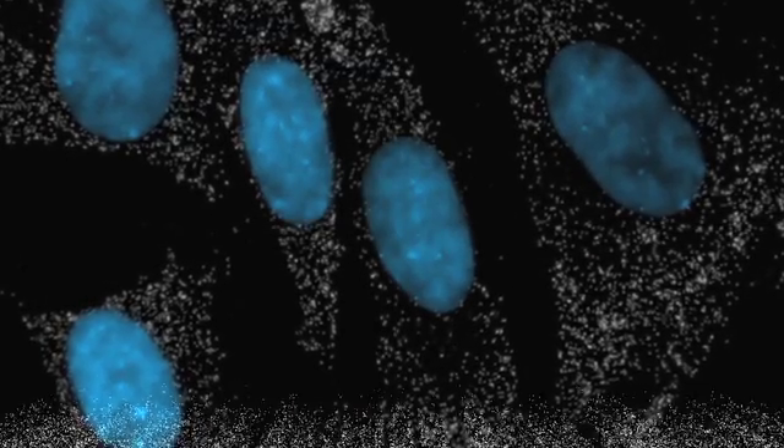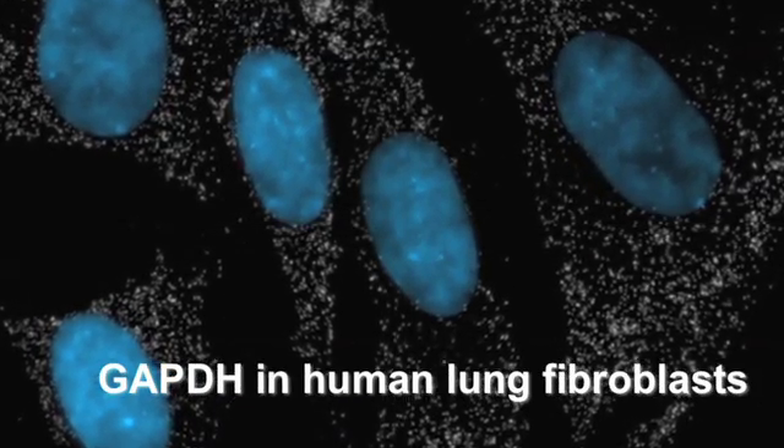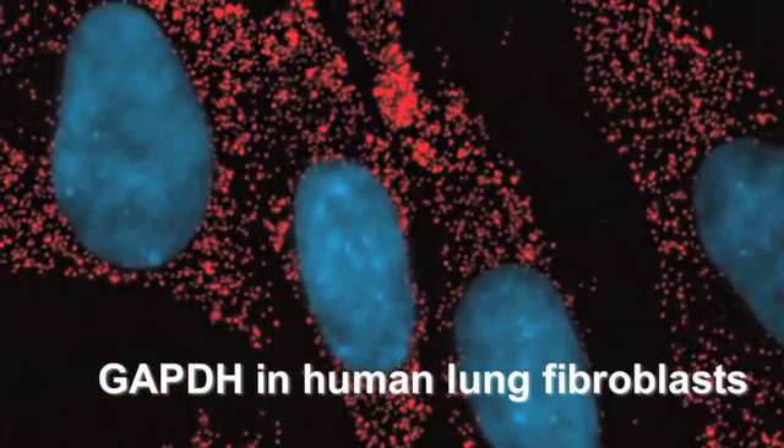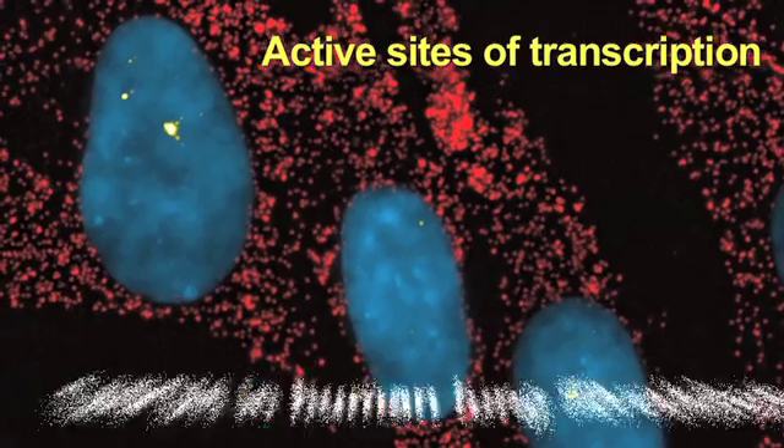One of the primary benefits of Stellaris technology is being able to visualize both the messenger RNA in the cytoplasm, as well as the active sites of transcription in the nucleus. And, unlike other commercially available RNA hybridization technologies, Stellaris FISH does not rely on artificially amplified signal. Stellaris probes directly quantify messenger RNA, providing more confidence in one's results.